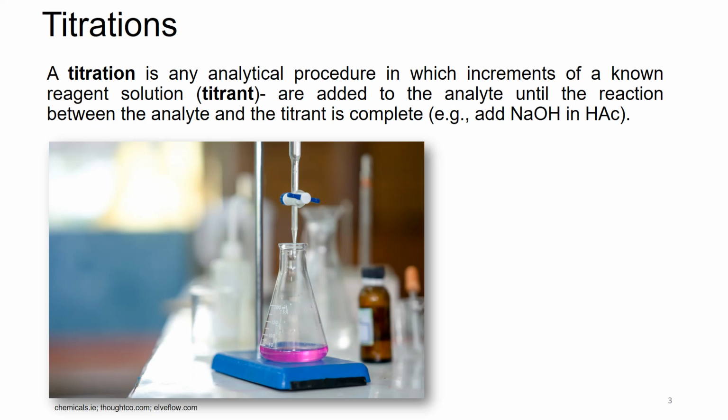A titration is any analytical procedure in which increments of a known reagent solution are added to the analyte until the reaction between the analyte and the titrant is complete. In this experiment, the titrant is sodium hydroxide. The analyte is acetic acid.